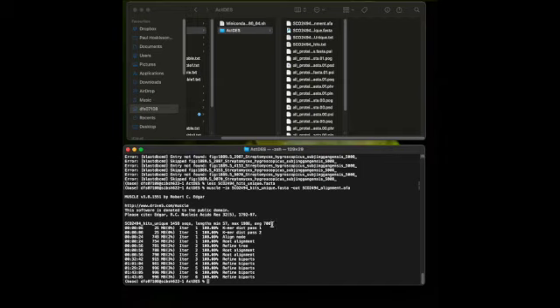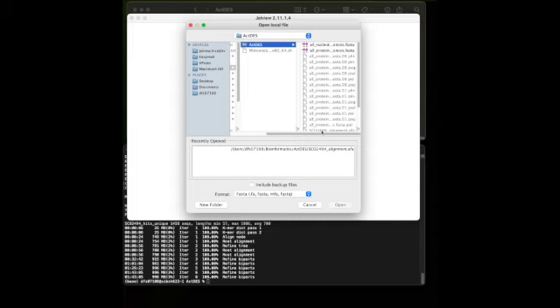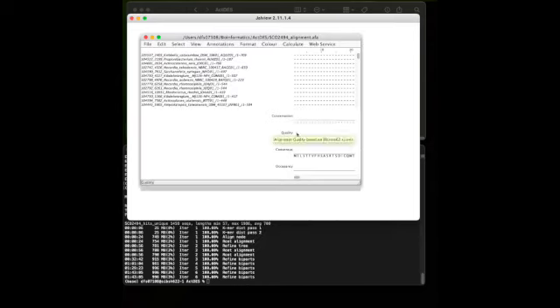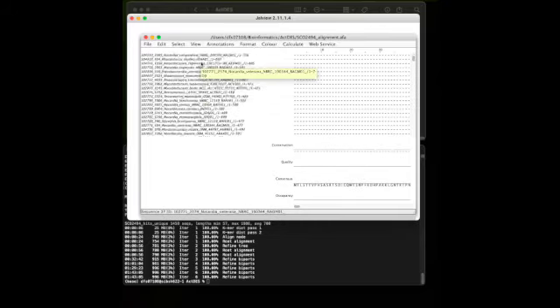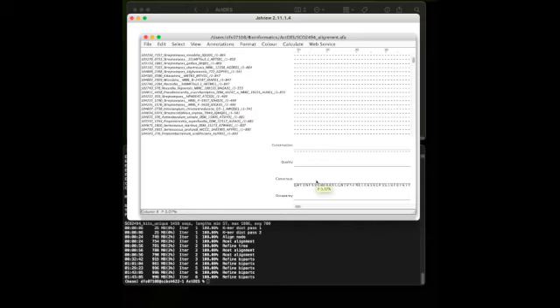So the easiest way to edit and look at this alignment to see how it's functioned is to run a program called JALView, which you should have downloaded. So you can open JALView, and you can open your .afa file that we created through the alignment. So you can tell it to open all files, and then you can open your alignment, and you can see in JALView that you've got all of the sequence names, and then you can look at the conservation, the quality, and the consensus sequence for your alignments.